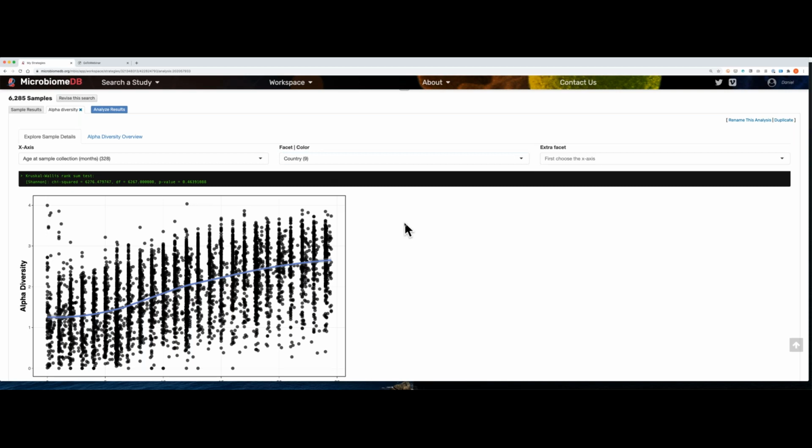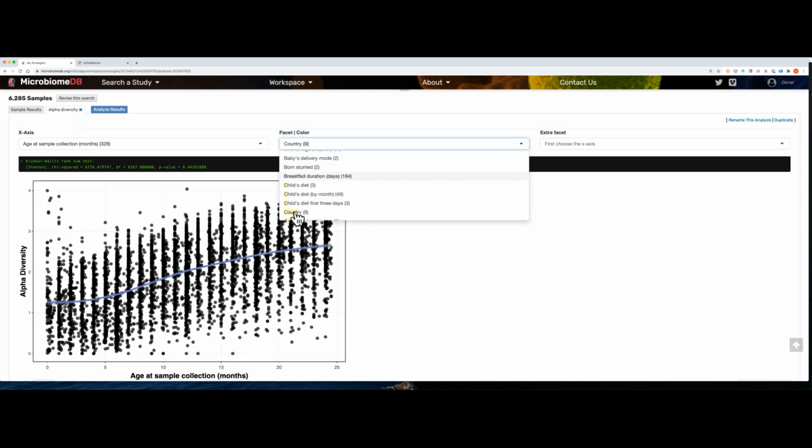Okay, so that might take just a second. I think it's going to plot. Maybe. Let me just try again.